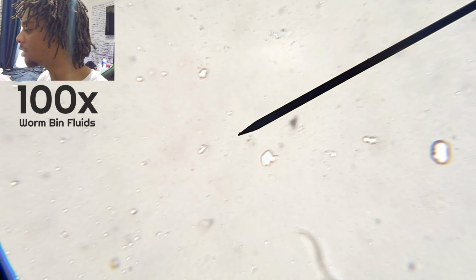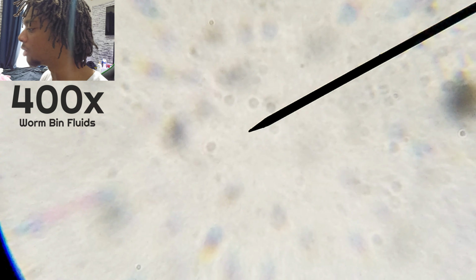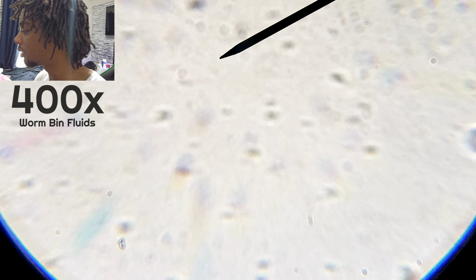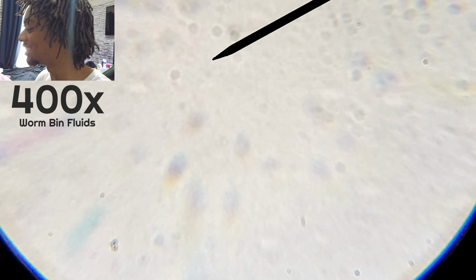I wonder if it's parasitic at all. Dude, hold still, freak. Got a little microscopic worm in the worm bin. Don't you dare turn around on me. Come back here, little weirdo. There you are. I should probably get a fancier, better microscope for this sort of stuff instead of just using my finger to manually push the slide.